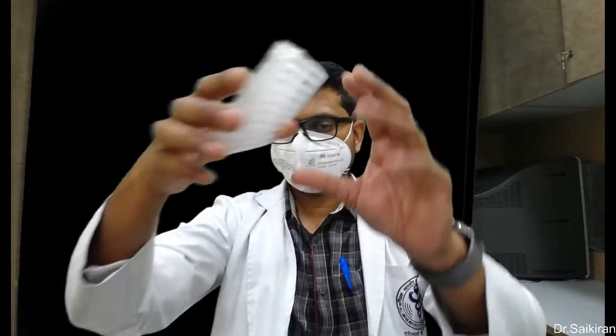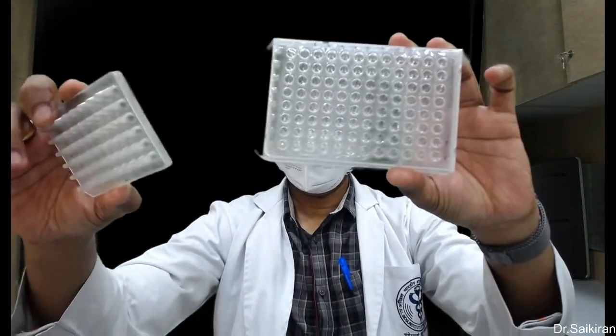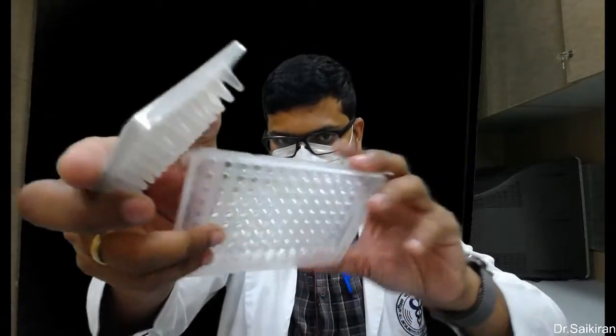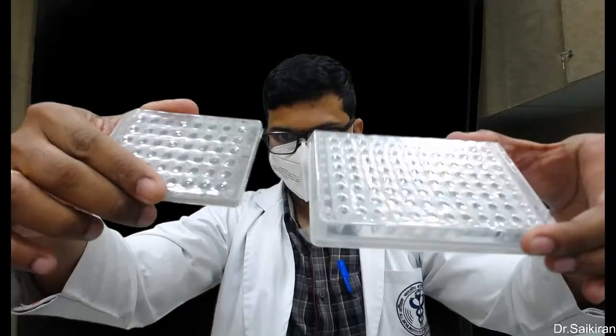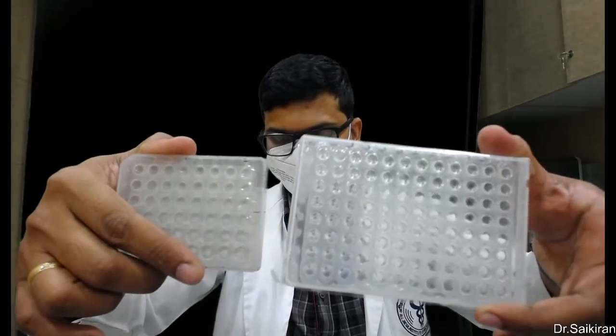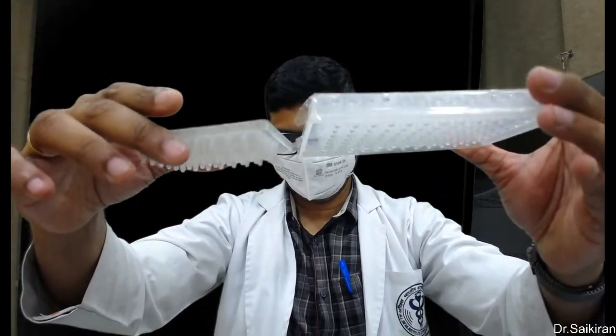So these are the plates, PCR plates. This is a 96 well plate. This is a 48 well plate. You can see. This is the bottom part. This is the upper part. So we load the extracted DNA and we put it on the thermocycler for amplification.